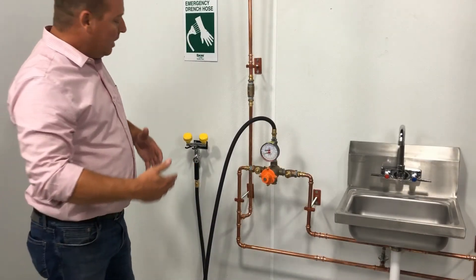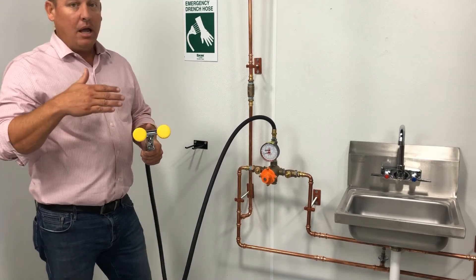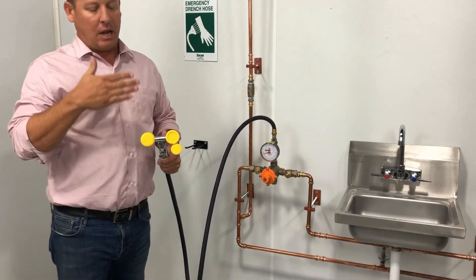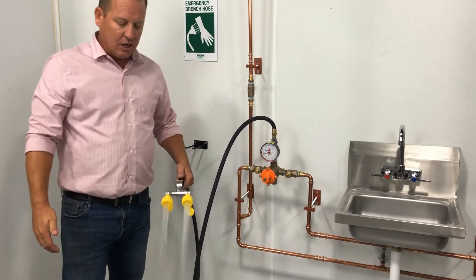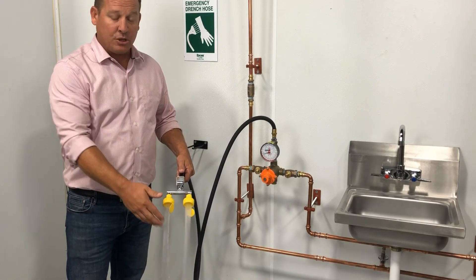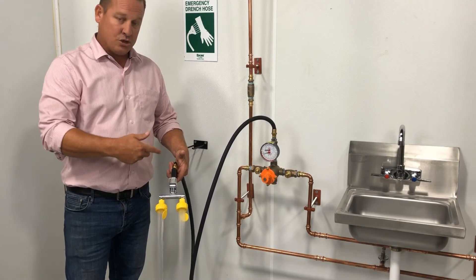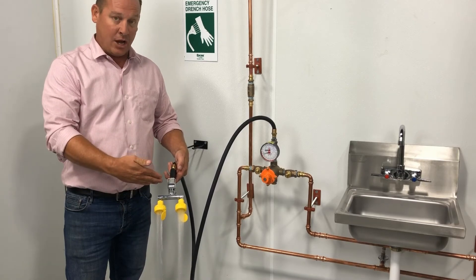Now that everything's connected, we're going to want to run this through a test. We're going to want to make sure that we're getting 0.4 gallons per minute out of this device at 30 PSI minimum, and also make sure that we're getting a range between 60 and 100 degrees coming through that hose. We'll just run that into a basic bucket, testing your temperatures and your pressure. One thing you're going to notice is that this has a locking mechanism on the handle — once you hit it, it's going to give you that flow in less than one second and then stay on.